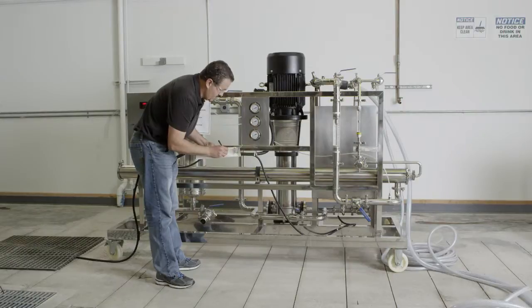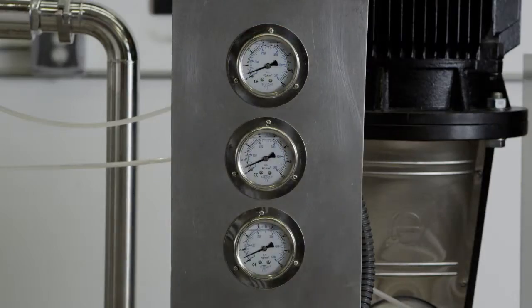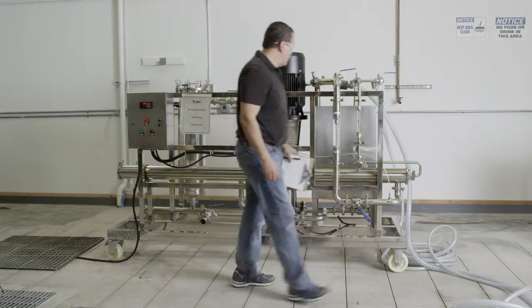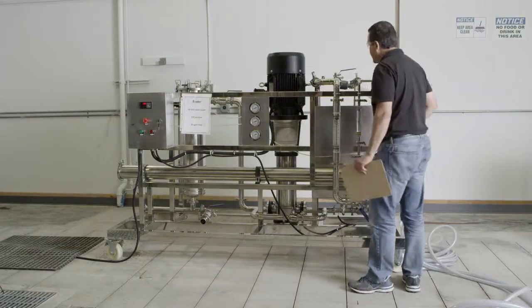During the initial startup, it is typical to experience some alarm conditions. These may result from system parameters not yet being adjusted properly or other causes. Address each alarm condition one at a time and consult with Cinder's technical support staff if needed.